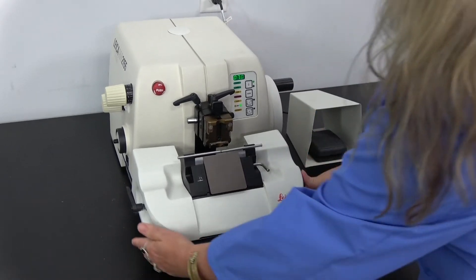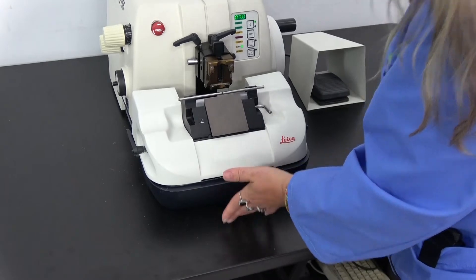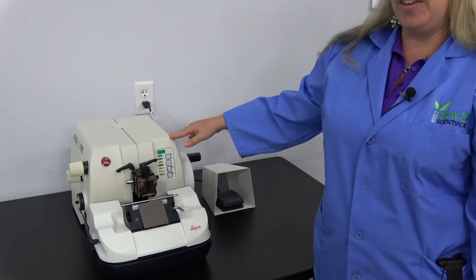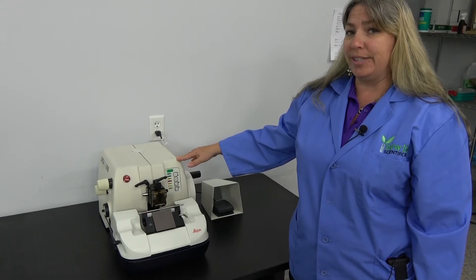This unit is also complete with the waste tray, which is a nice bonus. This unit has been thoroughly checked out by our in-house technicians. It is available in our Cridersville, Ohio facility currently and is backed by our 90-day warranty.